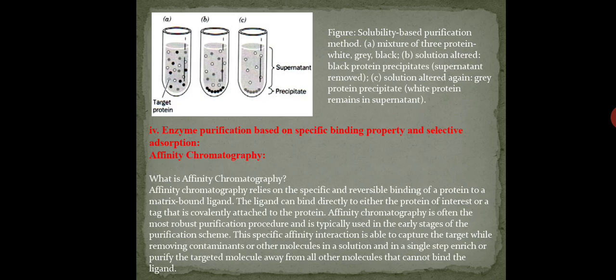Okay, now suppose in the next condition we have increased the salt concentration. Okay, we have added more salt. So what will happen? Salt will start interacting with water instead of interacting with the protein.